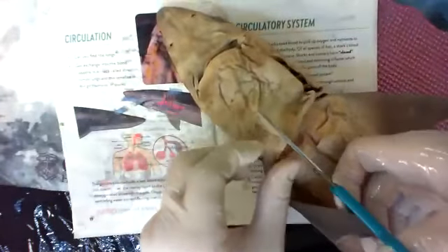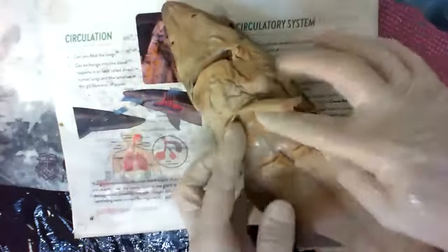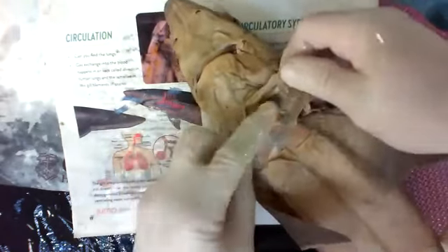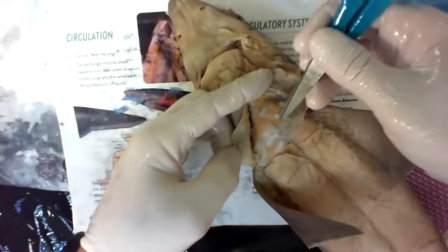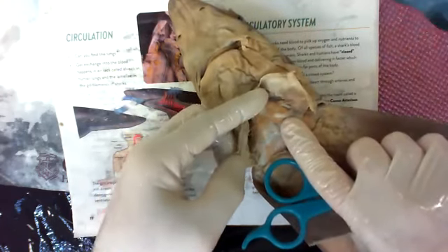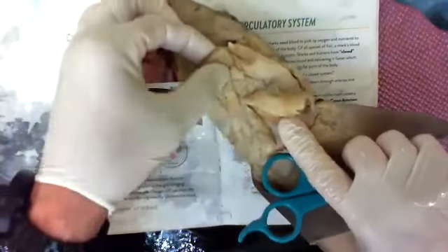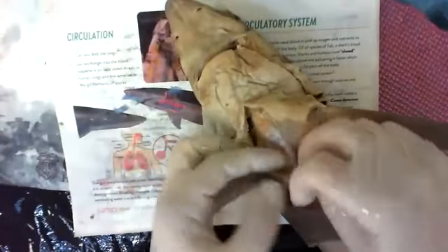And this isn't in the cuts, but because I separated all that, I can actually take my scissors, cut up, and now I can see the muscle groups. So there's the chest area muscles. I can see the gills up here on both sides. I can see the muscle fibers. When you look at muscle fibers like this, they're little tiny lines, kind of like the gills look. The lines go straight in this direction. That means when this muscle moves, it will always pull this side closer to this side. So this muscle must be for either retracting the jaw like this or pulling the whole head down, because they only move in one way. If I want to move another way, I have to have a whole other set of muscles to move in that direction. But look at that. You can see all the muscle.